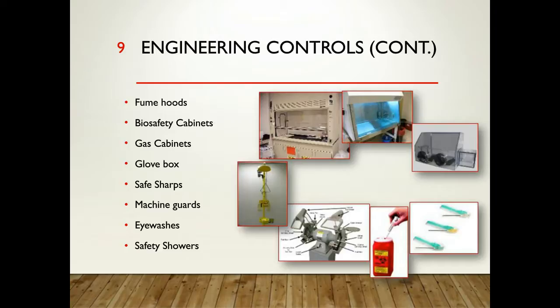Are the controls current? Do they need to be updated? Are they still compliant with the standards that OSHA or ANSI puts out? Are some of them unnecessary, or do you have equipment that you're not using? These are some of the things you should be asking yourself and asking amongst the design group. You don't want to necessarily replicate what you already have if it's not necessary. You want to make sure that you improve upon what you've already got and take advantage of this redesign period as a chance to make those improvements.